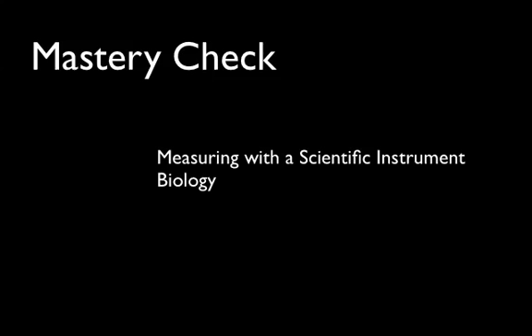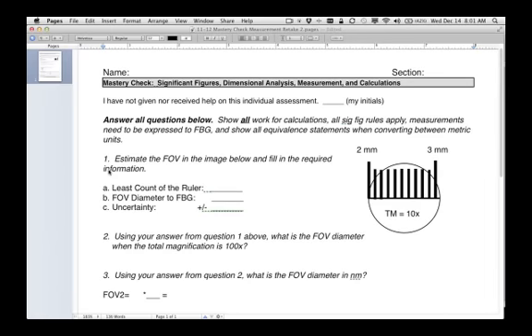Alright, so let's take a look at this mastery check. This mastery check is supposed to check your understanding of measuring with a scientific instrument, looking at sig figs when you're measuring to first best guess, also being able to change between units such as millimeters to centimeters, so a little bit of dimensional analysis, and also your checkup on calculations, being able to show the formula, substitution with units into that formula, and then answer with units.